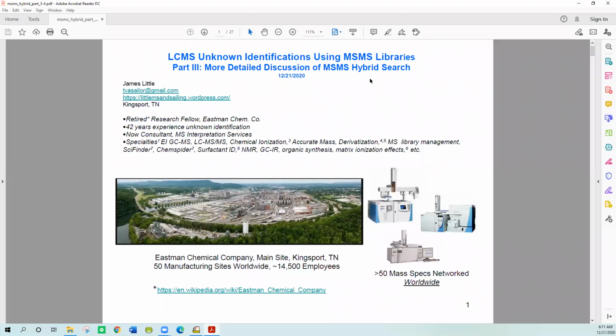Good morning. This is part three of a series of lectures or webinars on LC-MS unknown identifications using MSMS libraries. Part three is a more detailed discussion of MSMS hybrid search. I talked about it a little bit in part two, but this type of search is much different than the other two that I discussed. So I wanted to break it out into a separate one. And it's also the one I'm most excited about. It's a very powerful way to extend the dynamic range of your database for searches.